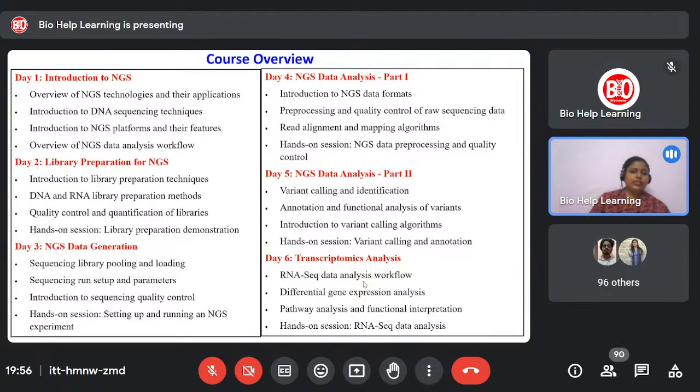During this 15-day NGS data analysis program, I am going to tell you the overall broad analysis project. We'll start from the introduction to NGS technology, where you can learn the features, applications, and workflows. Then, second, we will go through the library preparation of NGS, meaning how the library works: selecting the samples, isolating them, and then proceeding to library preparation. Third one is NGS data generation, how the instrument works.